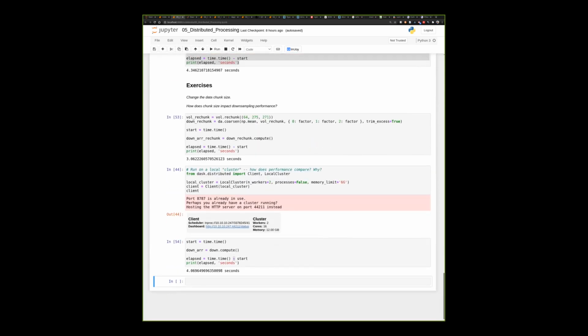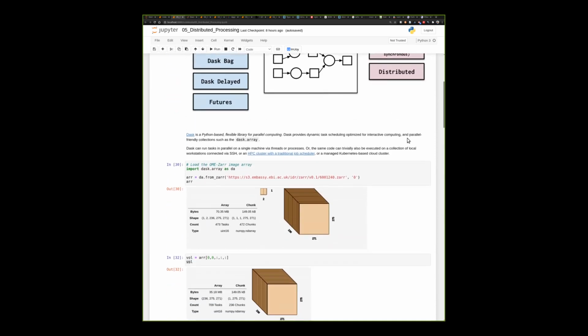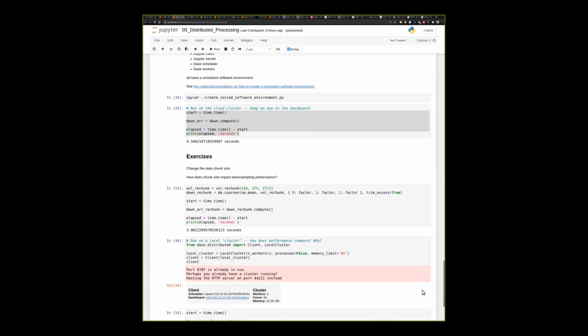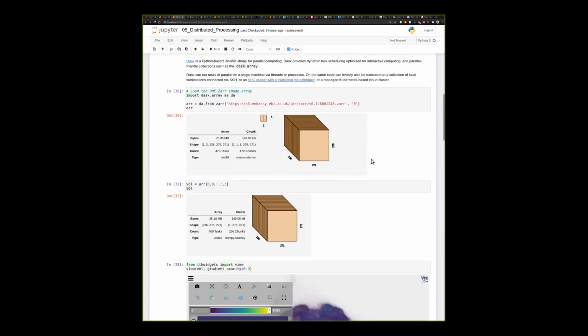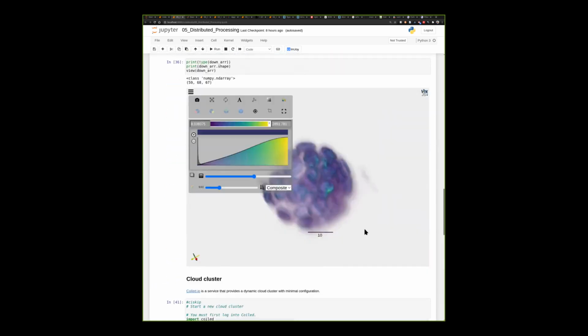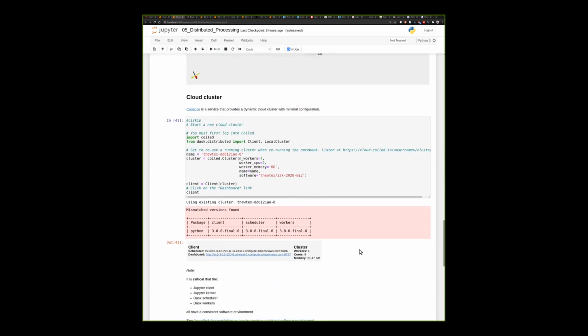As you can surmise from this experiment, it's going to depend a lot on where the data is located and how fast the network connections are. In this case, it may help to some degree. For larger data sets, of course, it's going to help a lot more. You can also scale the size of your cluster to work with larger data sets.